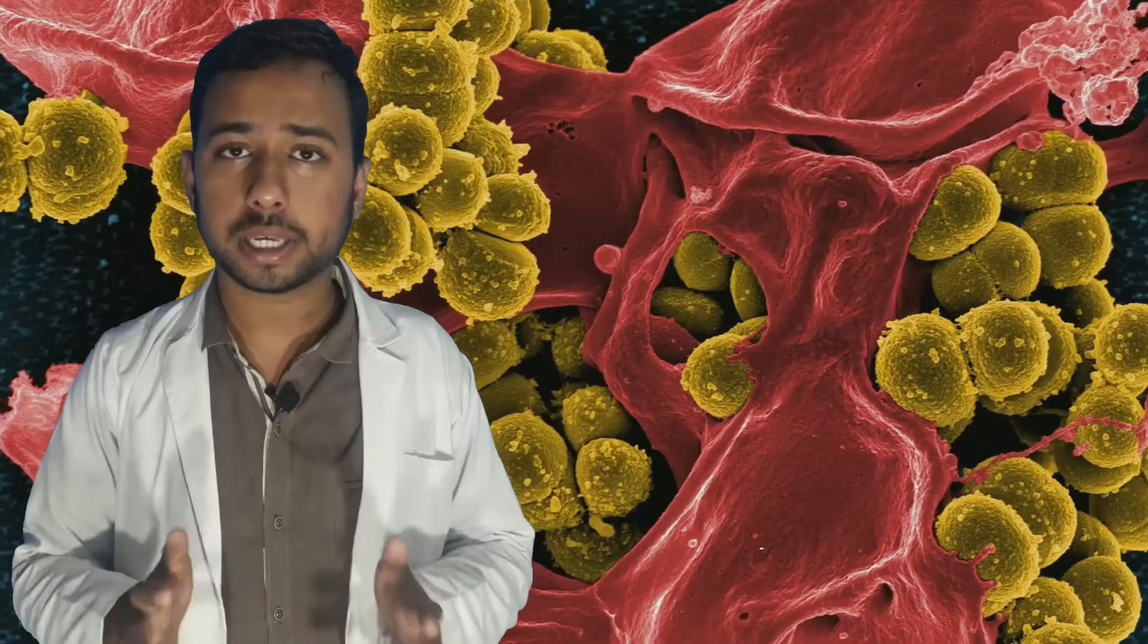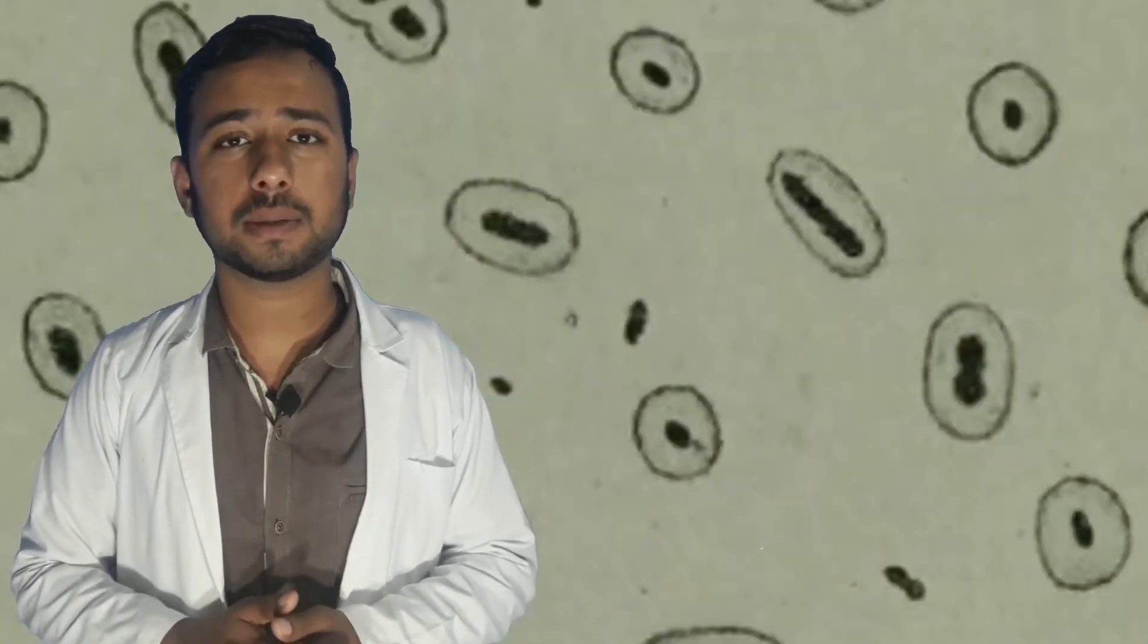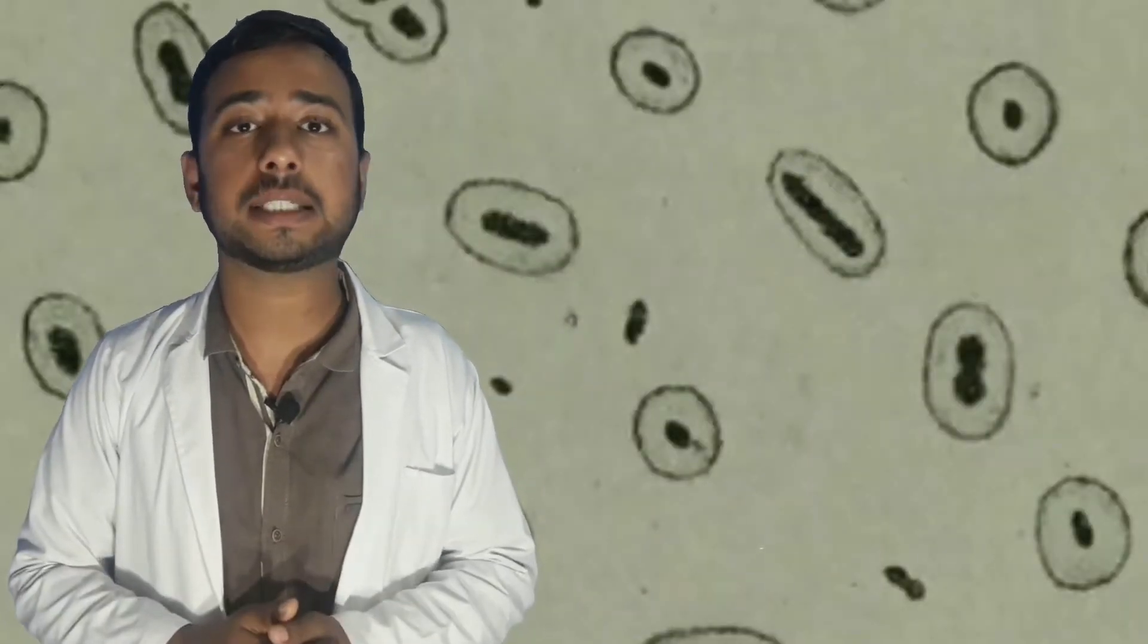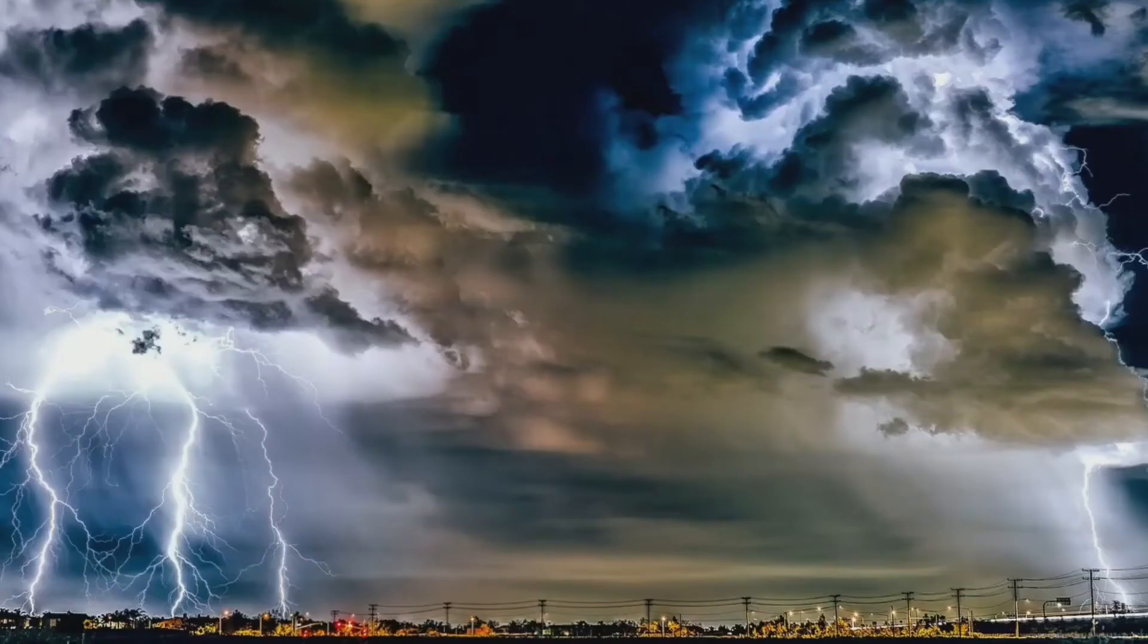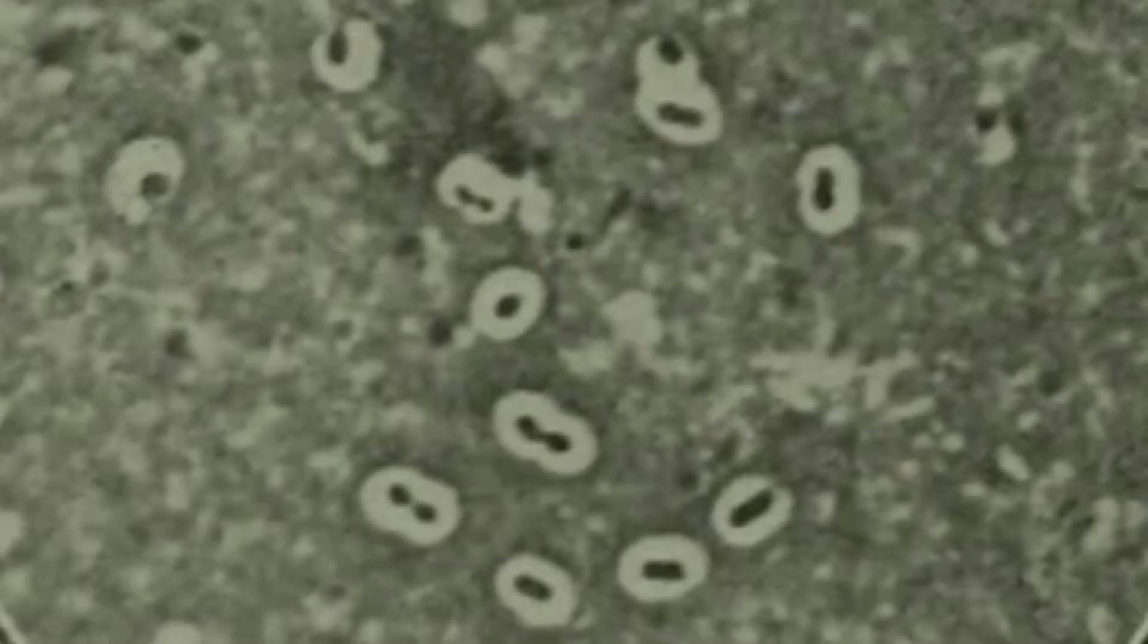Capsule is the outermost covering of the bacteria which protects it from its extreme surroundings. For example, our house protects us from extreme surroundings such as heat, temperature, or rain. Similarly, in the case of bacteria, the capsule also protects it from extreme surroundings. When we visualize the bacteria under microscope, the capsules look like that.